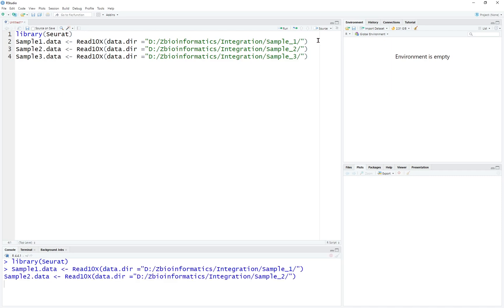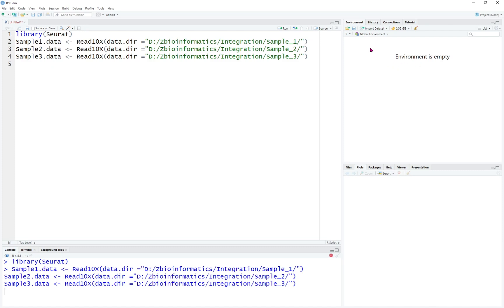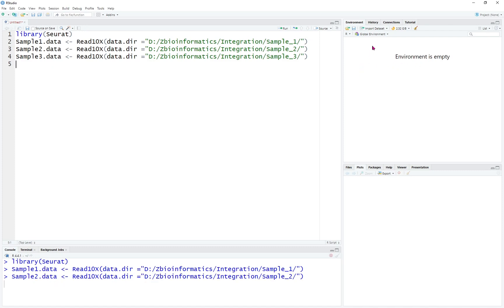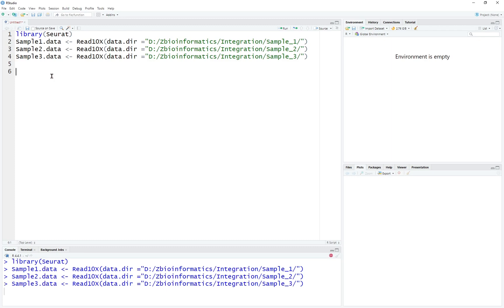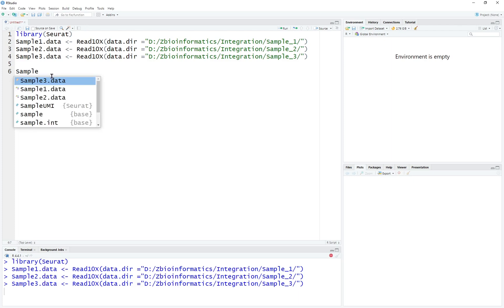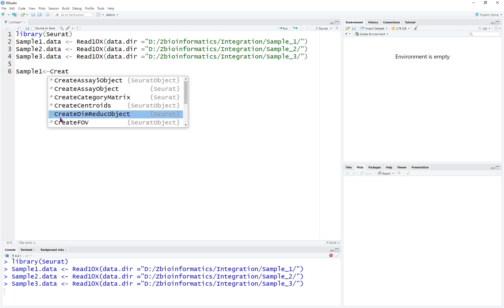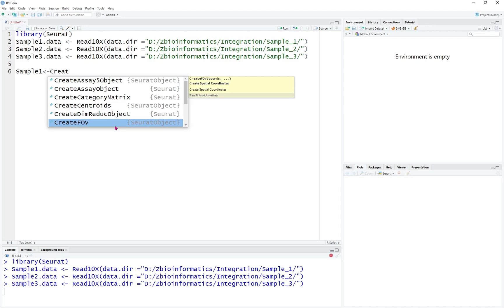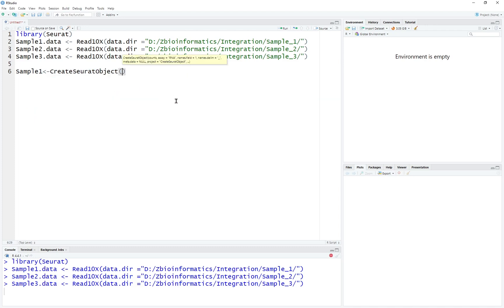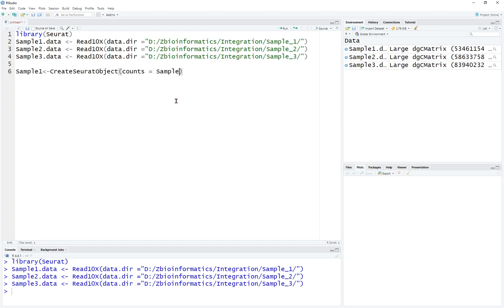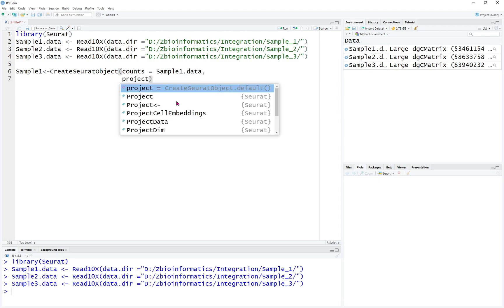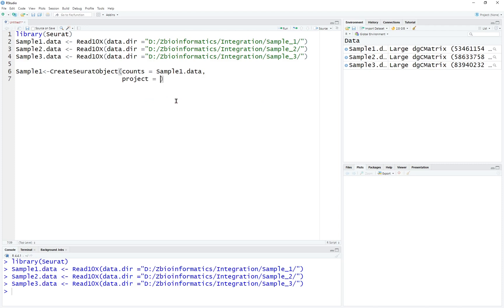We're going to read the three files, and on the right side of the environment you will see it load the data for sample 1, sample 2, and sample 3. After creating the data, we'll be able to create a Seurat object for the three samples. For example, sample 1 is going to equal to CreateSeuratObject. The counts value is going to equal to sample1.data.